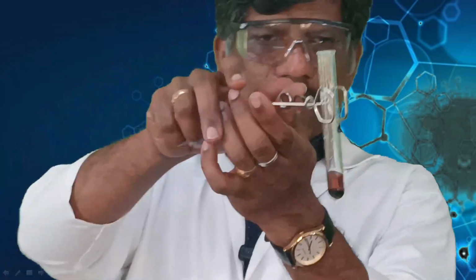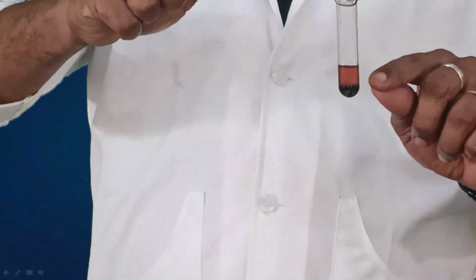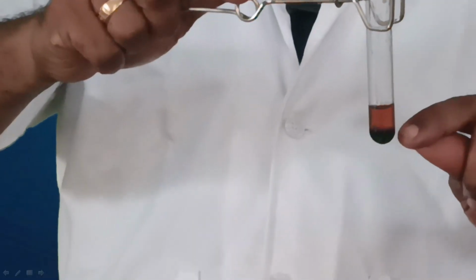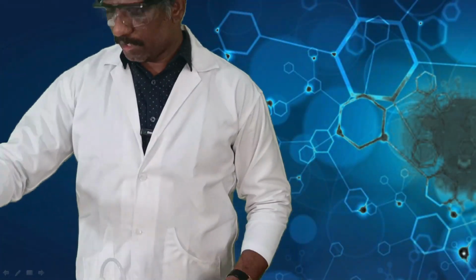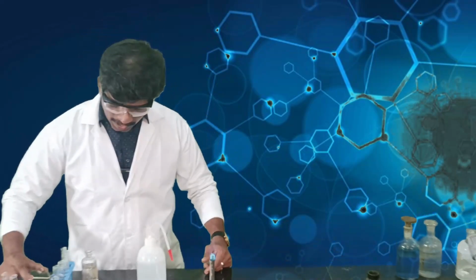There will be formation of a violet color ring. You can see the ring formed. Okay, this formation of violet ring shows the presence of a carbohydrate. This is the Molisch test. If you add concentrated sulfuric acid slowly, without shaking, you will get a violet ring. If you shake, the violet color spreads over.